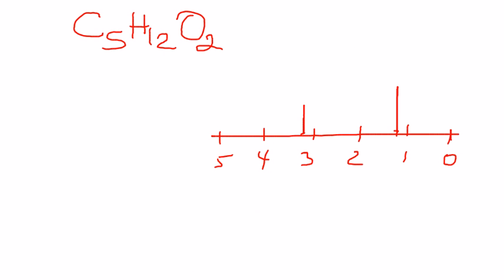So that is NMR spectroscopy in about 30 minutes. Carbon NMR follows exactly the same story as proton NMR, where every carbon signal is going to give you the number of such carbon atoms. So concept-wise, it's the same thing, and like I said, we are going to focus more on the proton NMR, but I just want to give you a flavor for some questions, like if, for instance, in this case, the molecular formula is given and some information about NMR is given, and you have to come up with the possible structures. You're given that only 2 peaks are obtained, one at about 1, the other at about 3.